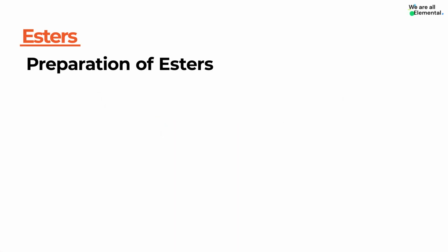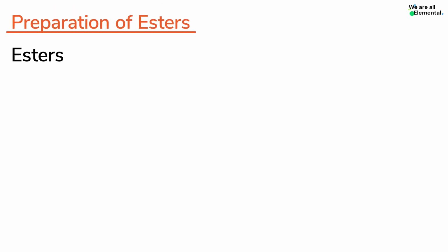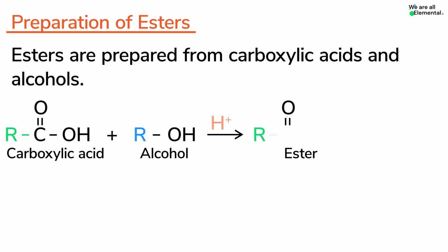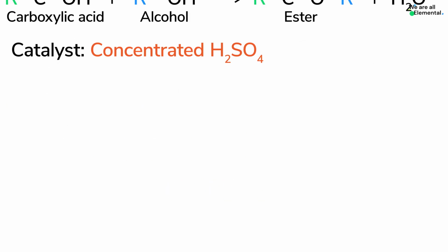In this video, you will learn about the preparation of esters and purification of esters. Esters are prepared from carboxylic acids and alcohols. Esters are derivatives of carboxylic acids, and the catalyst used here is concentrated sulfuric acid.